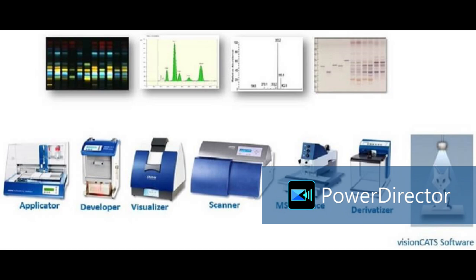Their absorption spectra. For example, if the questioned sample is not matching with any of the substance spectra available, is the library going to upgrade? We can add the spectrum in the library. We can create our own library. For unknown samples, if you find out which band it is, you can take the spectra and add it in the library. Library upgradation is automatic. Absorption spectrum library upgradation is automatic.